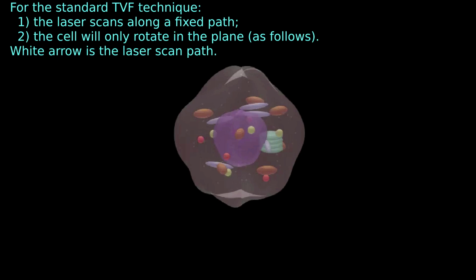In that technique, you then scan a laser across the scene. That laser will mildly heat up the thermoviscous fluid. That will cause thermal currents to flow in the thermoviscous fluid. The cell experiences a force and the cell will rotate.